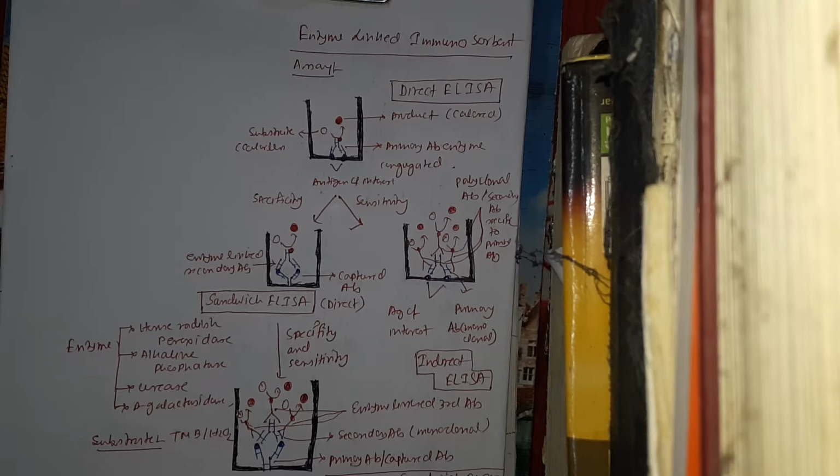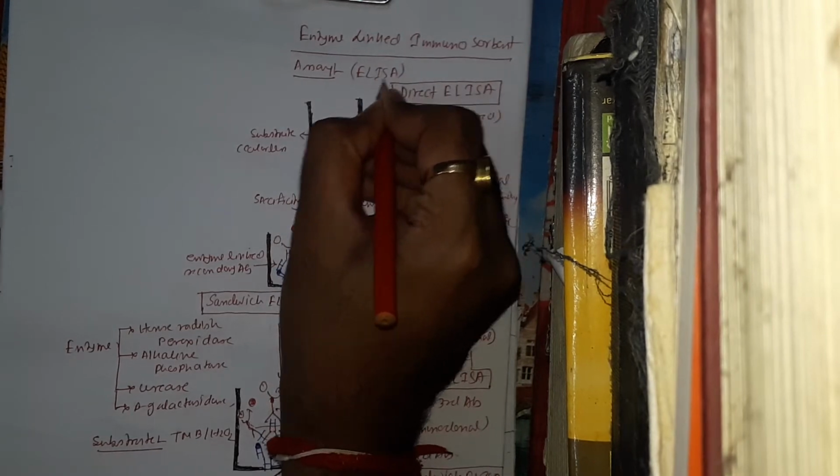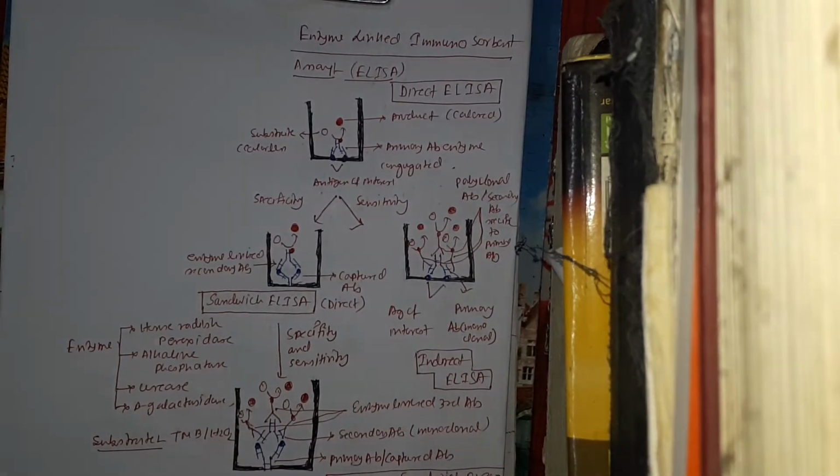Welcome back, guys. So today we are going to give a very brief description of enzyme linked immunosorbent assay, or you can say ELISA. I am going to discuss with you, in a very brief way and within 10 minutes, the whole funda of enzyme linked immunosorbent assay, and I guarantee you that you can answer anything from enzyme linked immunosorbent assay after that. Okay, so let's get started.